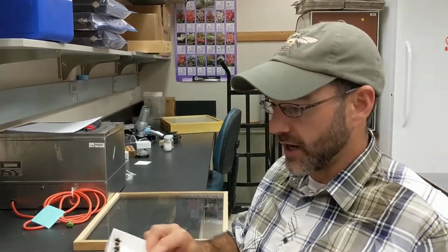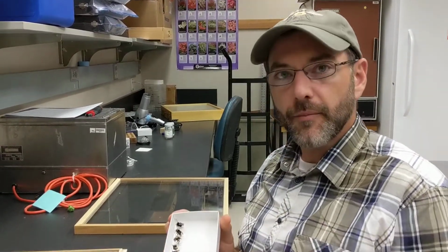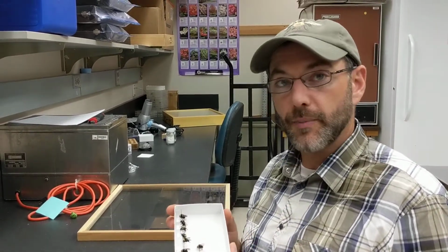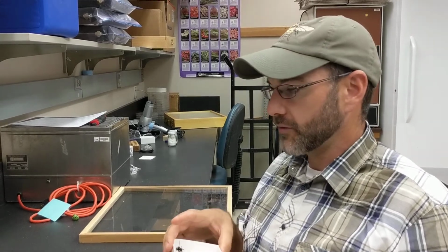But even when you're just first learning, it's a great task to try and figure out, how many different bumblebees do I have here? Can I separate out the males and the females by eye? And you can learn to do that, but like everything, you've got to put in some time and make a lot of mistakes, and also have someone that can check your work for you. And so through the atlas, I'll be checking your guys' work.